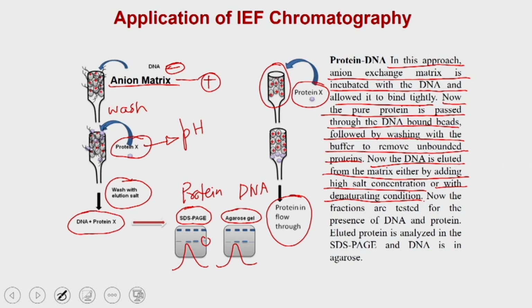Now, you can collect the fractions, and these fractions can be tested for the presence of DNA on the agarose gel and the protein on the SDS-PAGE. The eluted protein is analyzed in the SDS-PAGE and the DNA in the agarose gel, and that is what we have said.